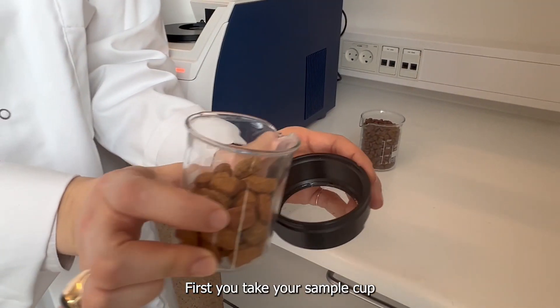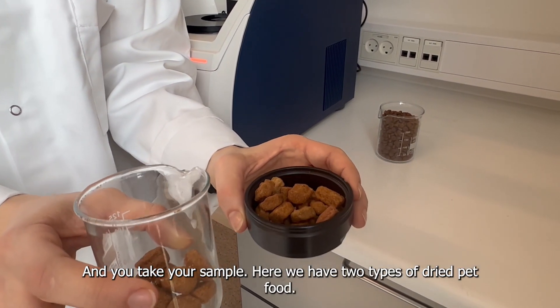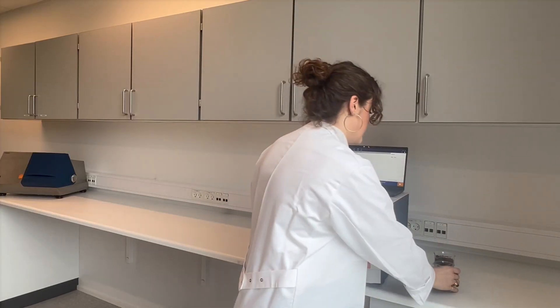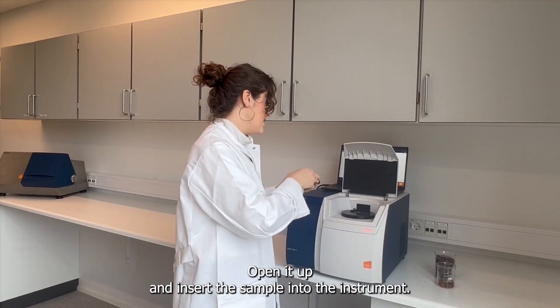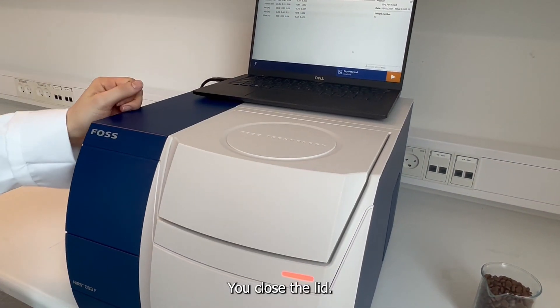First, you have your sample cup with your sample — here we have two instances of dried pet food. Take the lid of the DS3, open it up, and insert the sample into the instrument. Then close the lid like that.